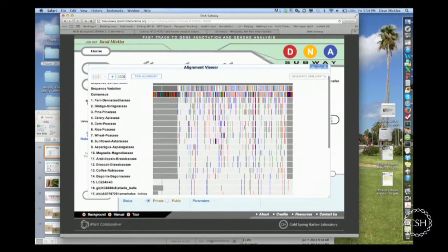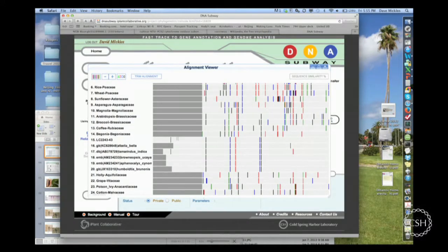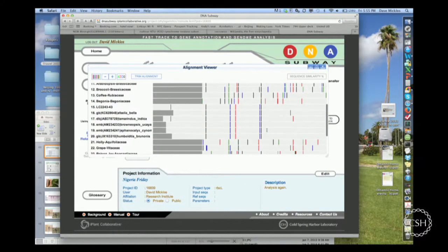Now, what you'll see if I focus in is here's my plant, the Akparata. Here's the Afzelia bella. And if we zoom in a bit using this feature up here, I'm going to focus. Of course I could just do these two on their own.